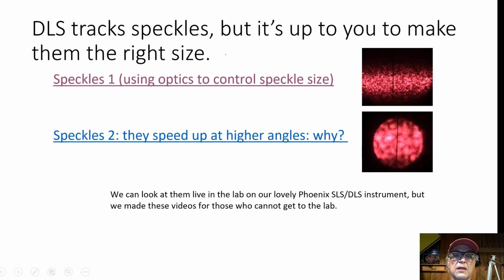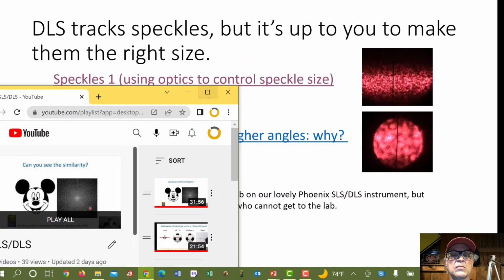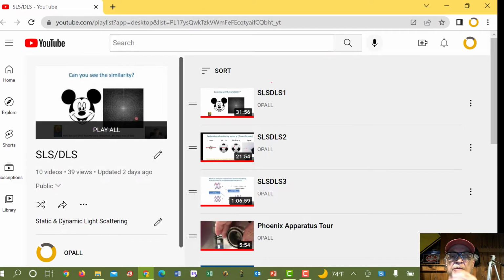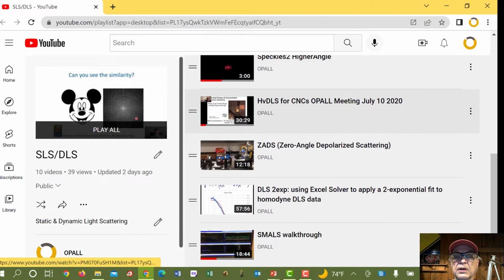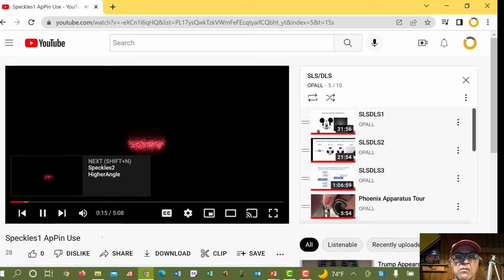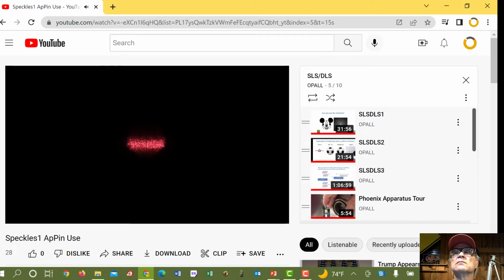Okay. Oops. Should take you to Opal's YouTube site. It was intended to take you right to Speckles, but it somehow didn't. Speckles 1. Okay. Now we'll close the front aperture down to 100.